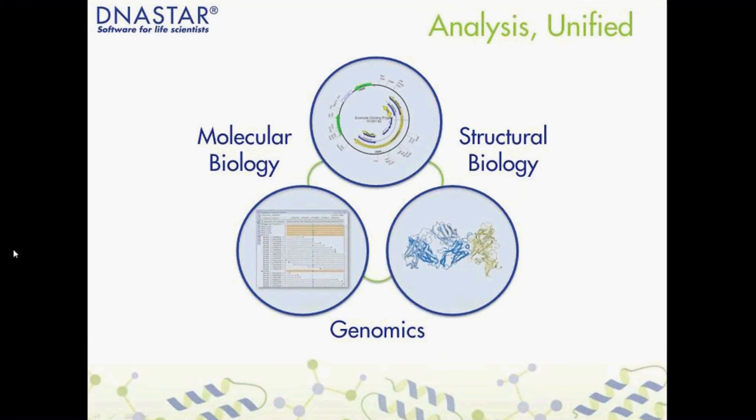DNASTAR has been in business for over 30 years, and we've come a long way in that time. Founded in the lab of Dr. Fred Blattner at the University of Wisconsin, DNASTAR's commercial efforts were focused on DNA sequence analysis and molecular biology software. As the fields of molecular biology, genomics, and biochemistry evolved, so did we, providing tools for next-gen sequencing analysis, and most recently, developing applications for protein analysis and structure prediction. As well, we're now offering all of our software on both local computer and cloud platforms.